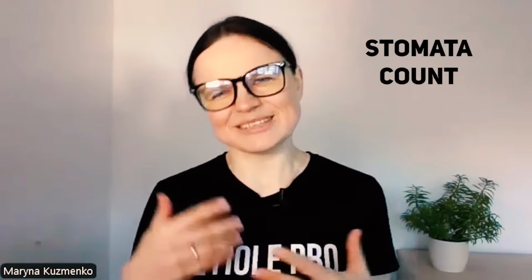So today we will speak about stomata and stomata count, just one specific task. And again, as usual, I'm repeating my topics a little bit and trying to give you more and more details, because I have already recorded the video and it will be here, where I explain how the stomata count using computer vision and deep learning works. At the same time, I will just add an extra bit.